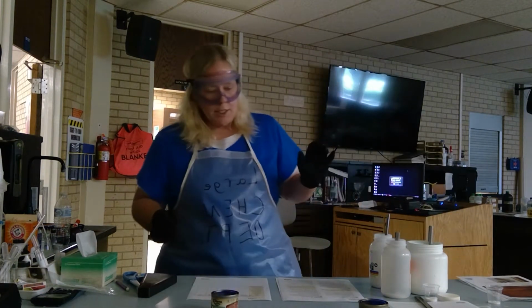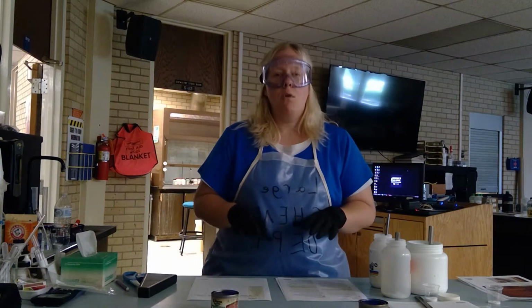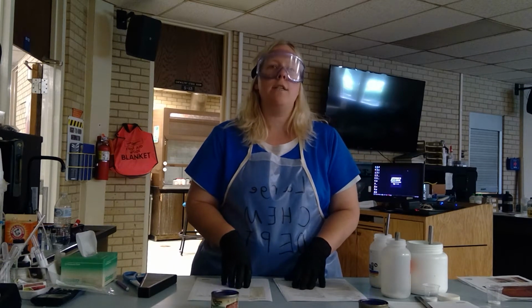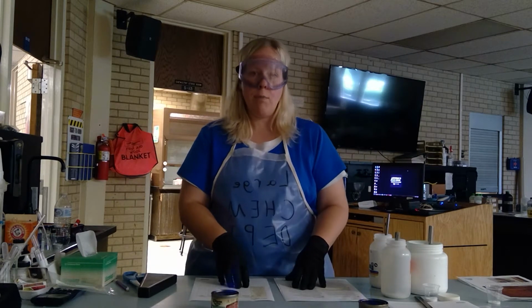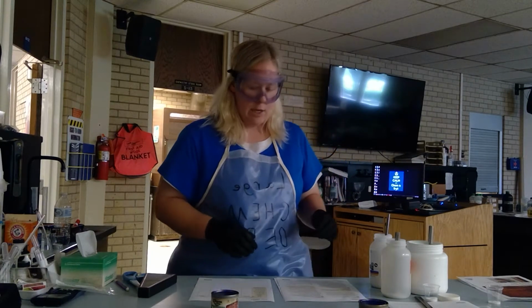So we're going to be continuing on with the atomic emission and flame test experiment. If you're watching this video, you should be familiar with what I'm going to be telling you. By watching this video, you're going to be getting a lot of notations and a lot of shortcuts that we're going to tell you for this. Activity 3, Dr. Hathcock and I just performed it, and we noticed some issues. We were not able to duplicate the experiment and get the results for what needed to be seen. So therefore, if we're having troubles, you're going to have troubles too. So we're going to modify this a little bit.